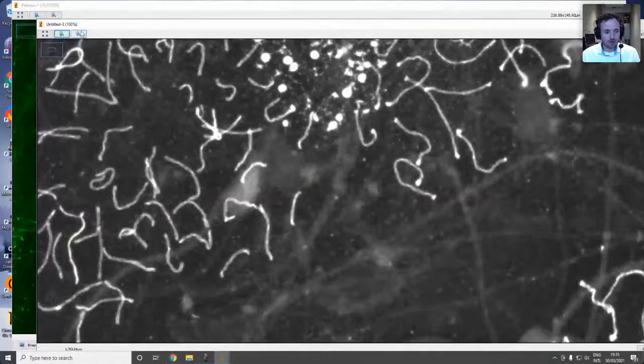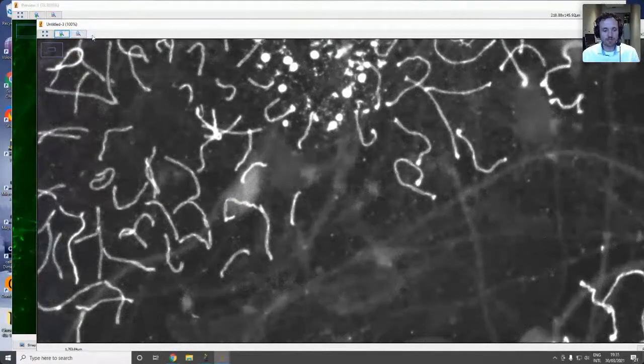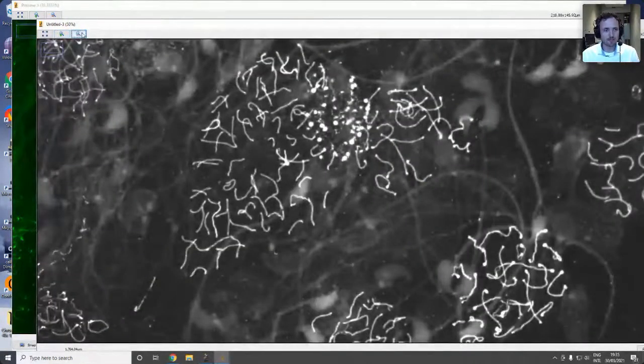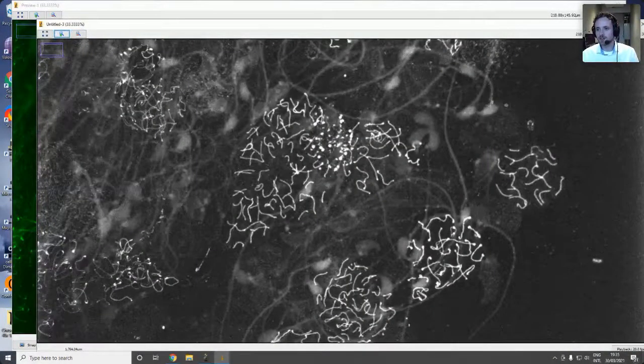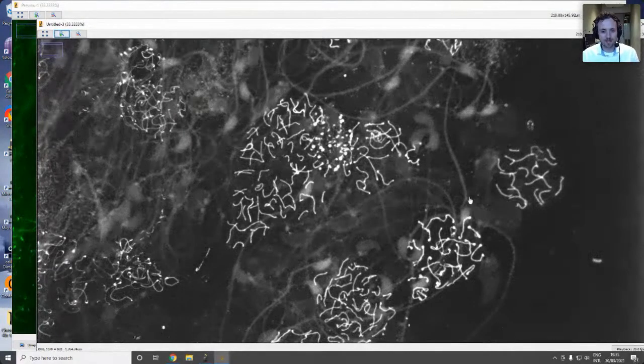And this is all also possible due to the ever increasing complexity of cameras. So this camera really has a huge amount of pixels. I'm scanning here over 16 megapixels. The image pixels are tiny, they're 2.5 micron.